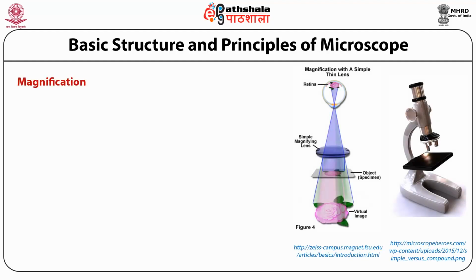As I mentioned in the previous slide, magnification is the core of microscope-based imaging, so we need to get better magnification. So how is a small object magnified? Here is the schematic as well as the details of a magnification process.